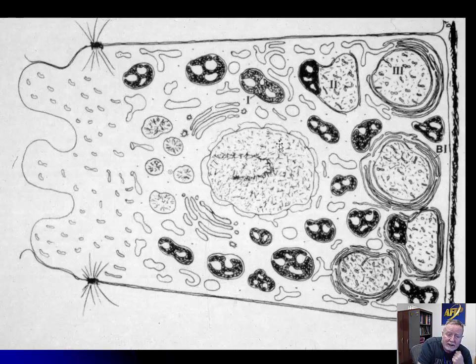I think the first thing we'll see is you will see the nucleus. You will have dissolution of chromatin. The nucleoli are totally gone. Both fibrillar and granular parts have broken down. This cell is probably struggling to maintain any form of homeostasis, whether it's sodium, potassium, or calcium.